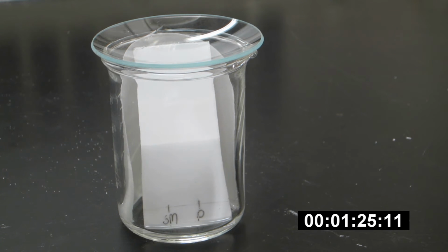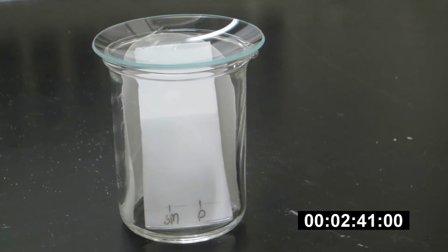During the elution process, it is very important that the chamber remains undisturbed. Do not move or pick up the chamber once the TLC plate is placed inside. The elution process only takes a couple of minutes, so it is not recommended that you walk away from the TLC plate for very long.